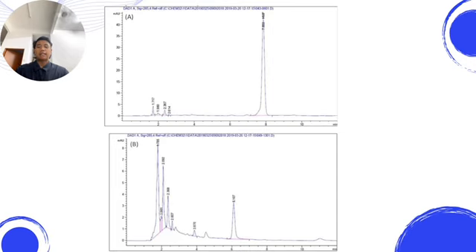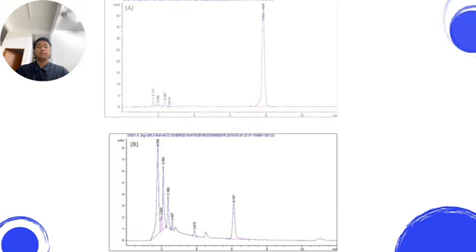The presence of HMF can be seen at about 7 to 8 minutes in the chromatogram on graph A. The presence of very low amount of HMF in our honey samples suggests that the honey was fresh, not heated, and free from hydrolyzation of other syrups.